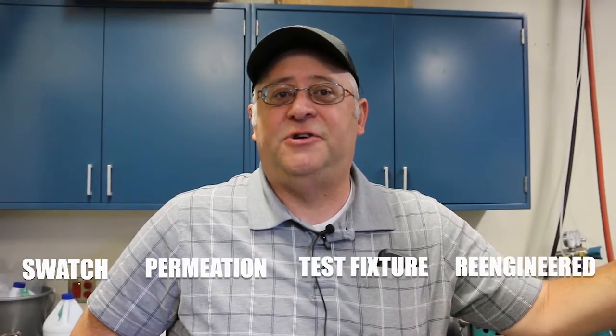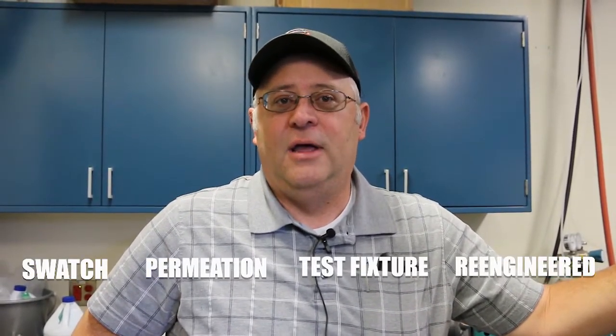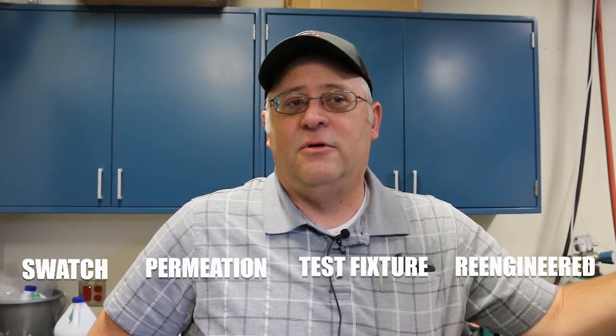I'm Darren Jolley. I'm the quality manager in the chemical test division, and I'm also the lead scientist and manager for the development of the Spitfire test fixture. Spitfire stands for Swatch Permeation Test Fixture Re-Engineered. And I'm going to walk you through some of the capabilities and show you the fixture and what we do with it.